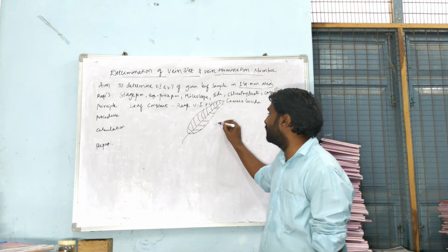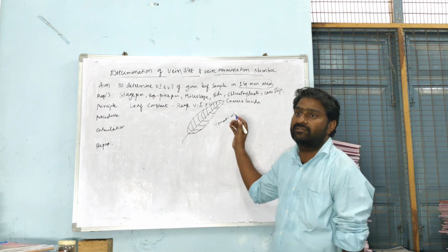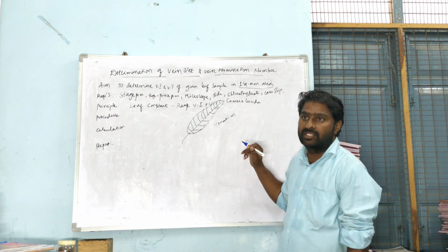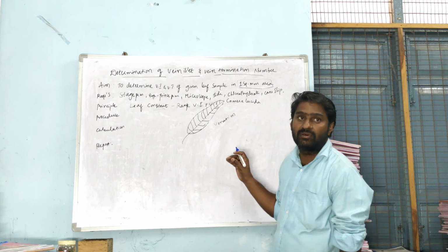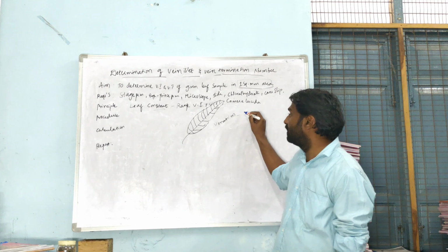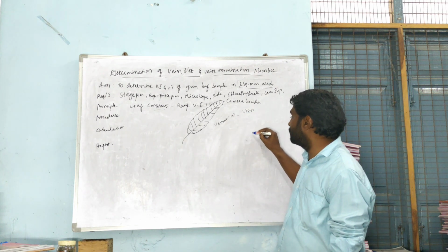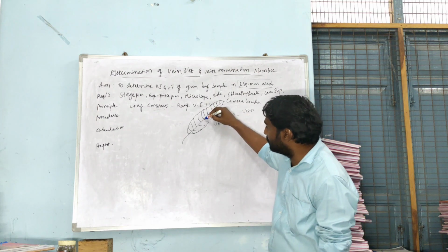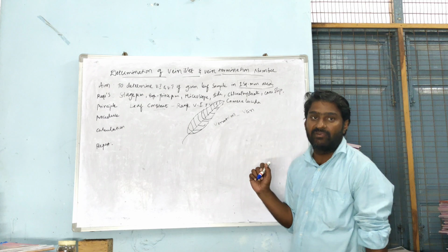As the venation is spread throughout the leaf, definitely the size of the leaf would be larger. If the spread of venation is less, the size of leaf would also be very less. Apart from these veins, where the veins are incontinuous and spread throughout the leaf starting from the midrib to the margin of the leaf, generally we call them vein islets.